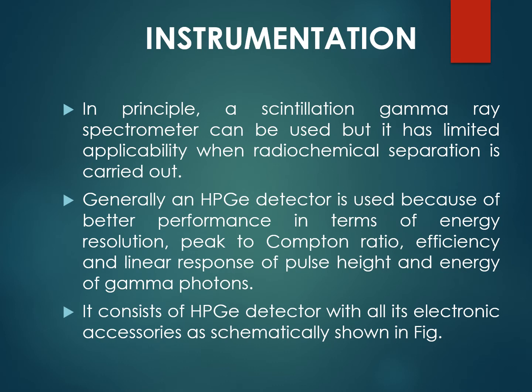And the higher atomic number of germanium gives a much larger linear attenuation coefficient, which leads to a shorter mean free path. So there are many more advantages of the germanium detector over the silicon detector. That's why the high purity germanium detector is used much more efficiently and conveniently than silicon detectors.